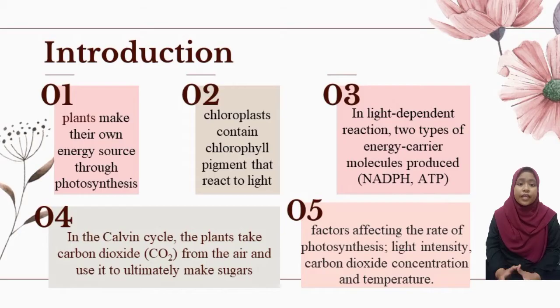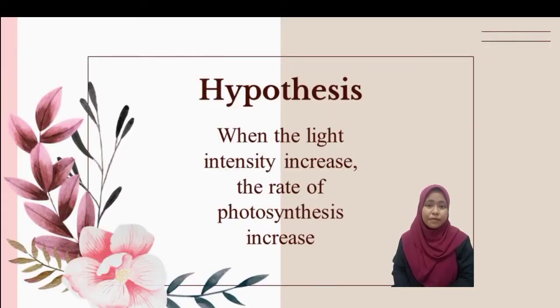There are many factors that can limit the rate of photosynthesis, which are light intensity, carbon dioxide concentration, and also temperature. The hypothesis for this experiment is: when the light intensity increases, the rate of photosynthesis will increase.